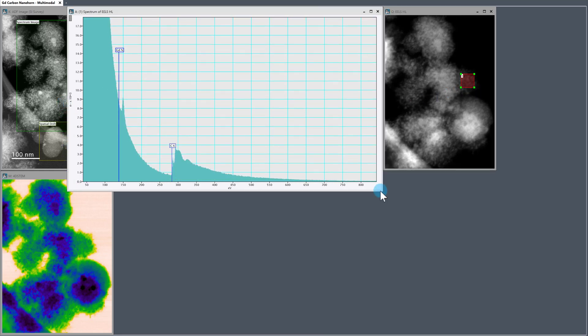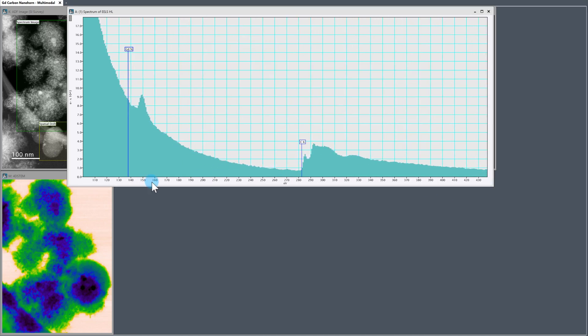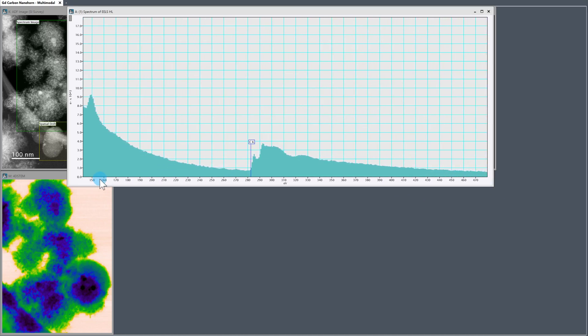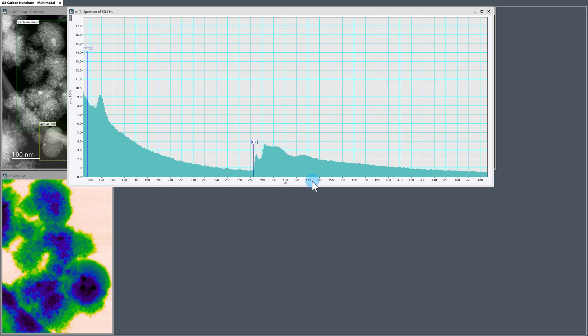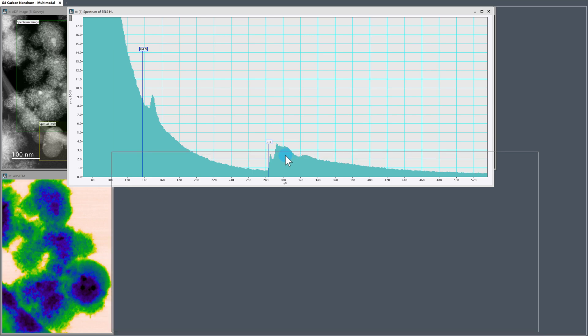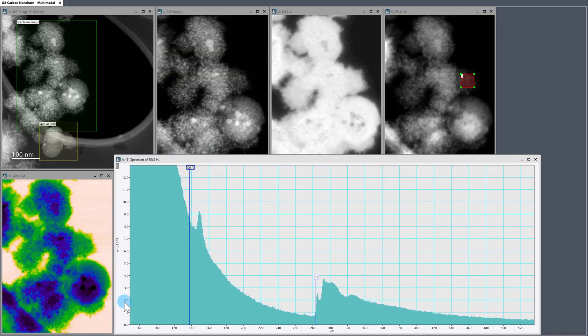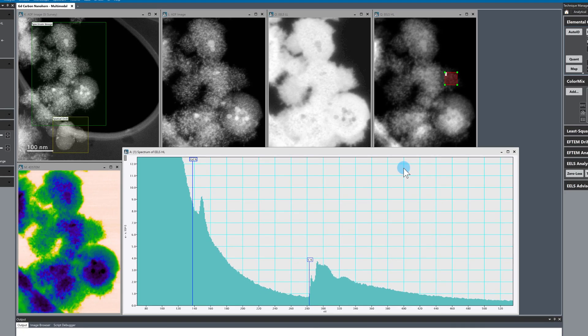So we can see that we have a nice gadolinium-N edge and a carbon-K edge, and we have good signal-to-noise ratio because we're using a counting detector, and also because we're looking at the high-loss dataset, which has a longer pixel dwell time in the spectrum image.